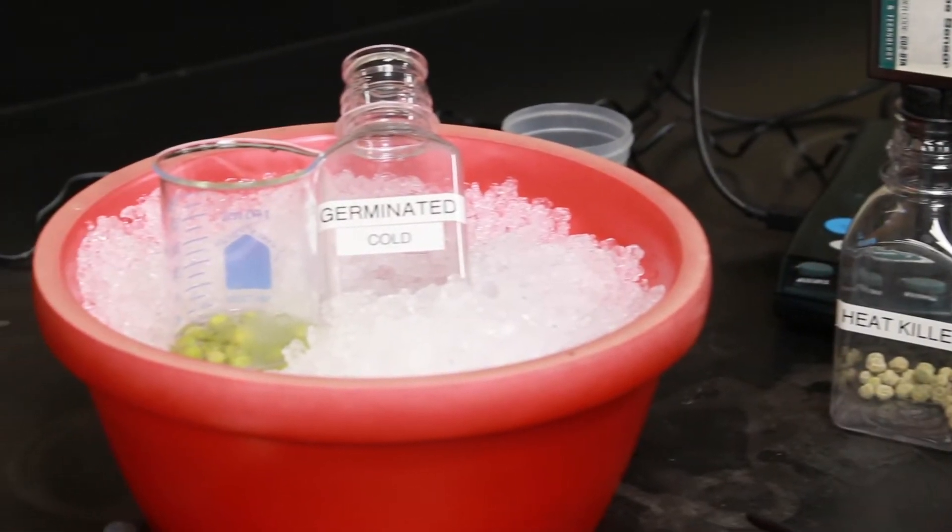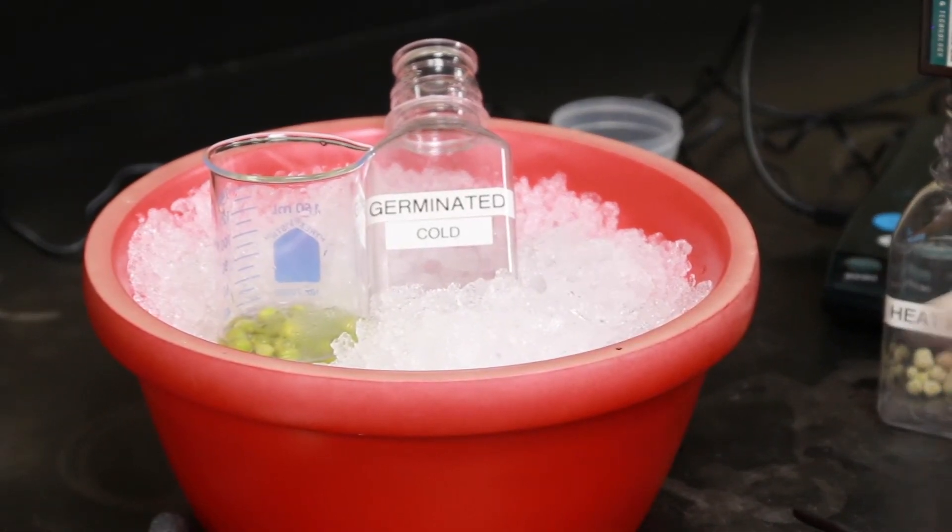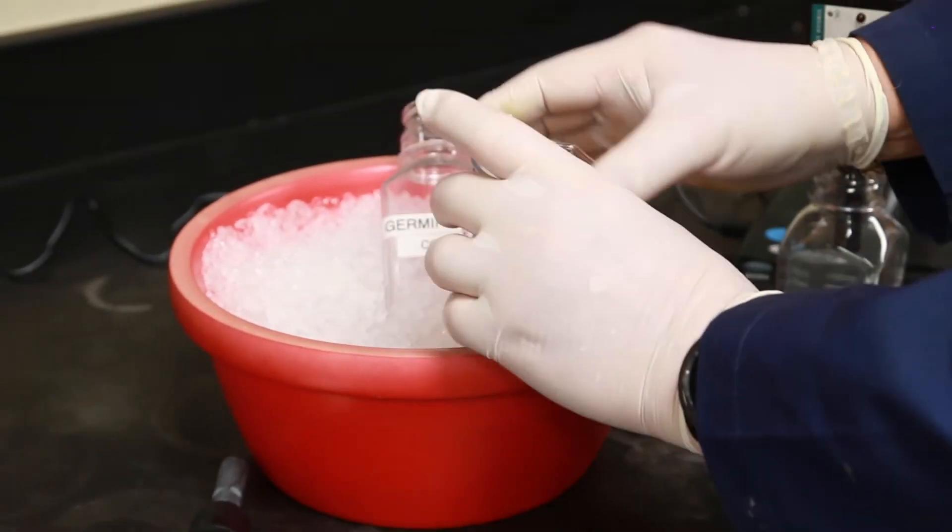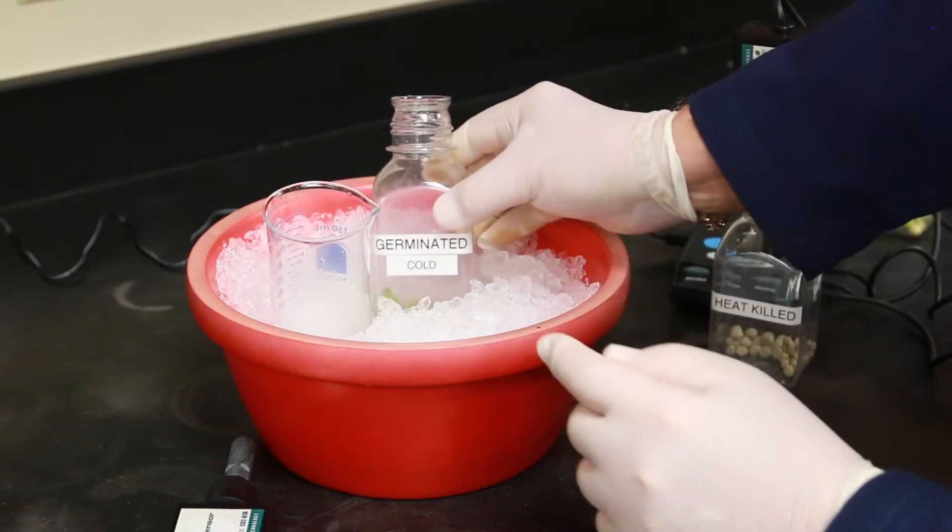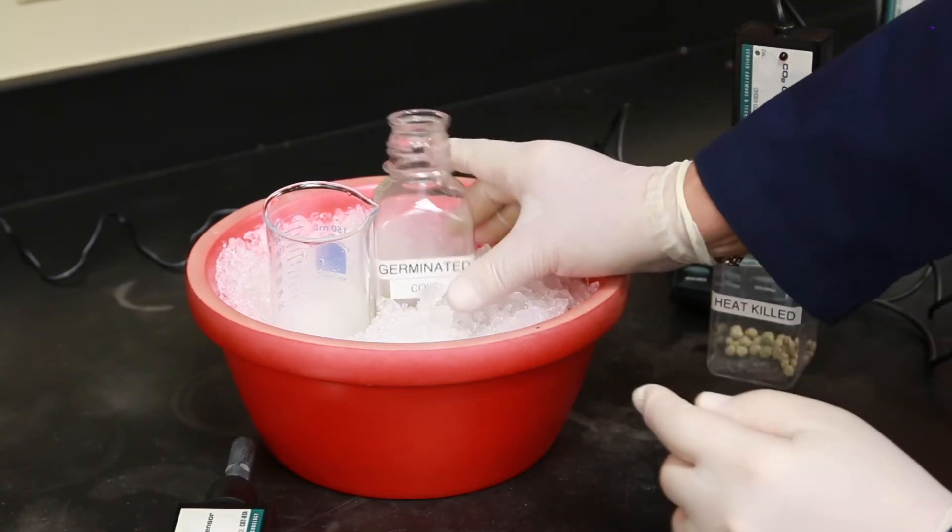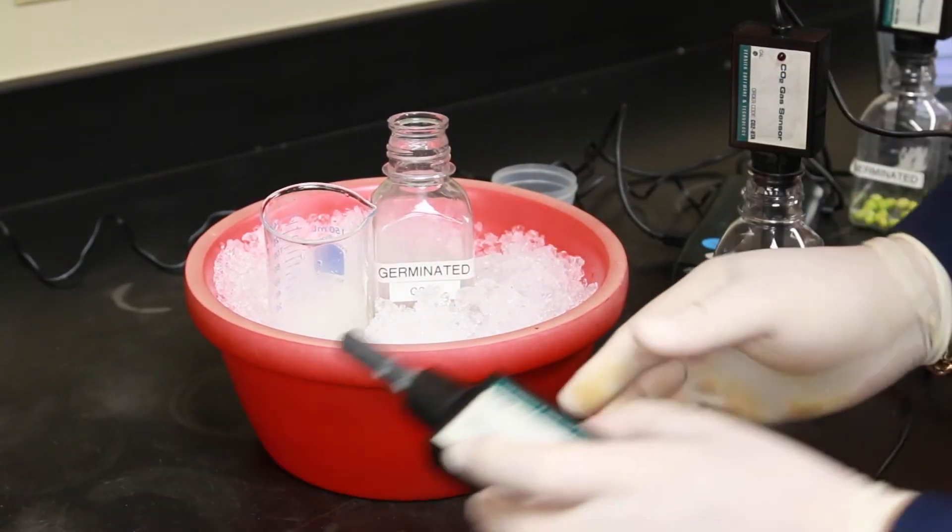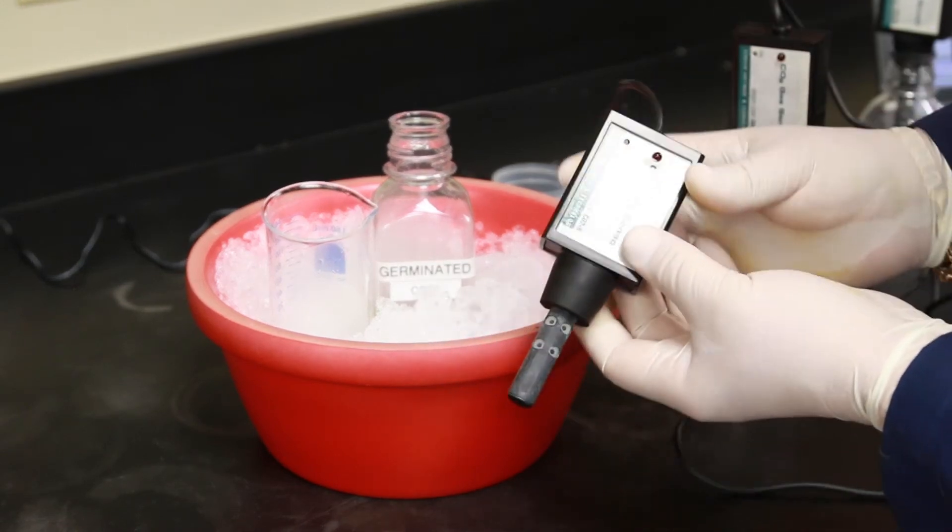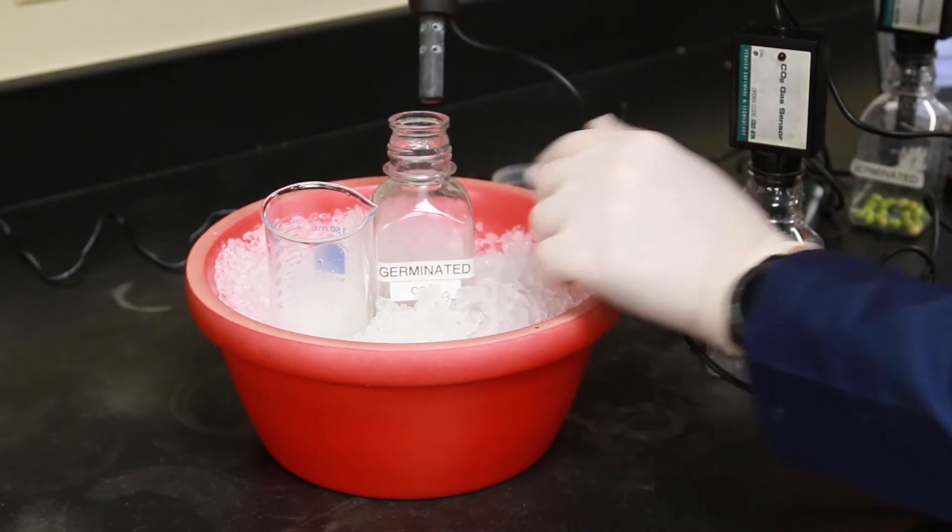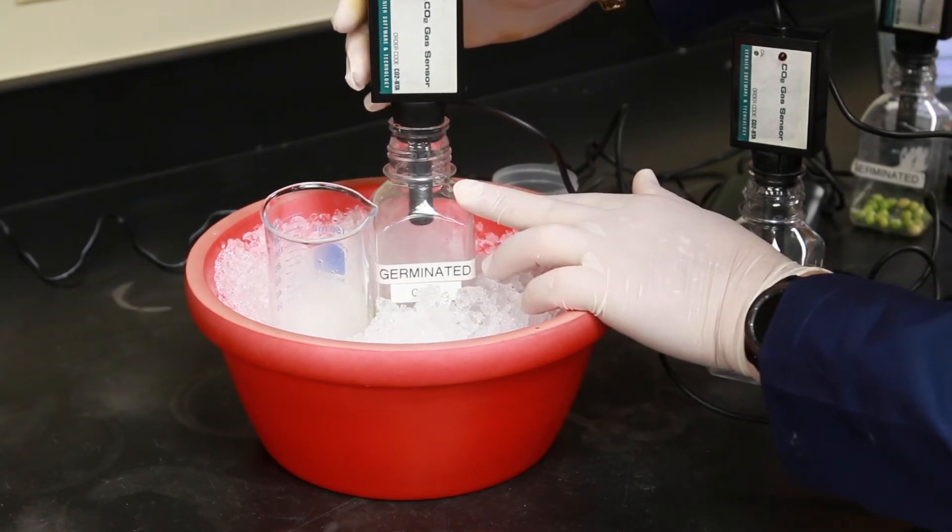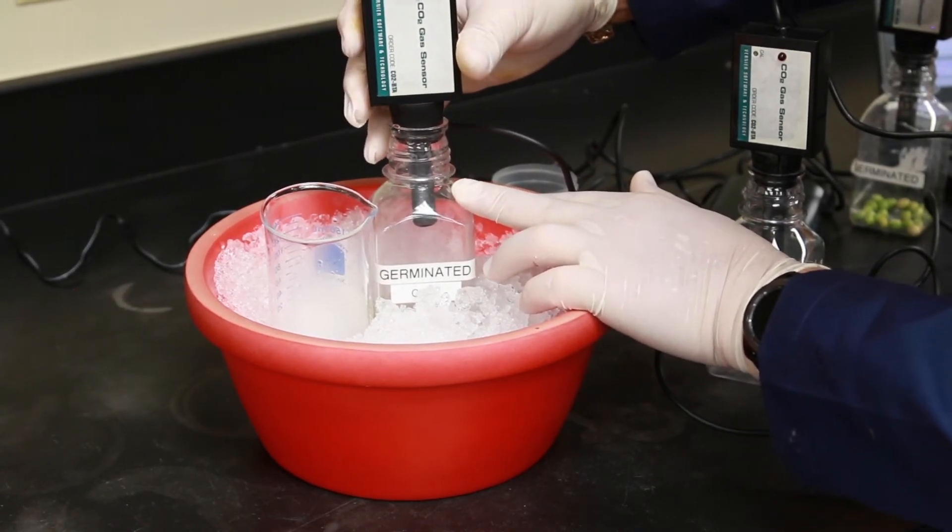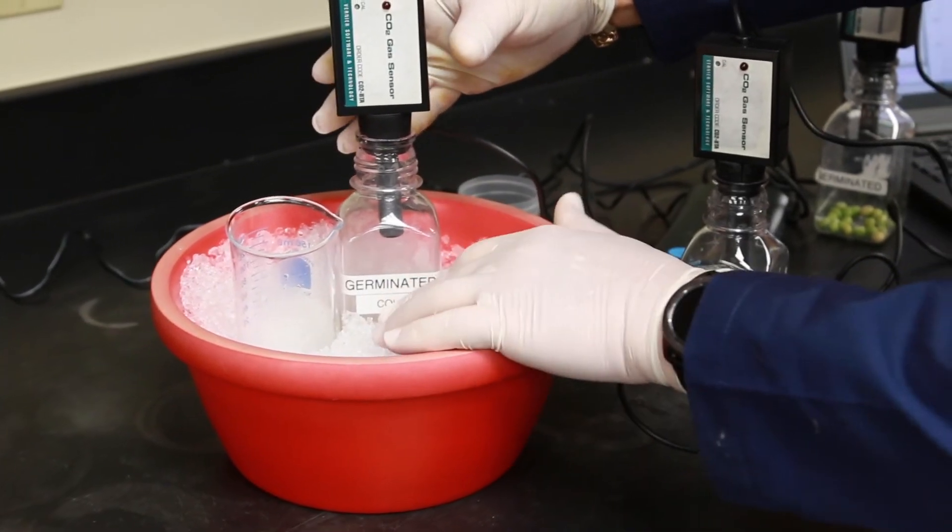Now we're on to the cold peas, these are germinated peas that have been placed on ice for about one hour. We don't want the peas to be frozen, we simply want them to be extremely cold. Once the peas are added to their own plastic flask we do put the flask back on ice and add the next CO2 sensor. Again we'll have to allow this flask to equilibrate for about one to two minutes before collecting our data.